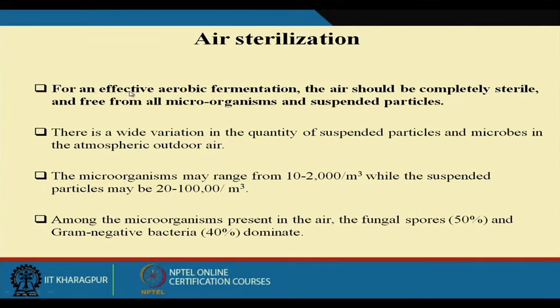Since we are passing air more and more, there is a possibility of contamination in the fermentation process. So the question comes, how will we sterilize the air? For an effective aerobic fermentation process, the air should be completely sterile and free from all microorganisms and suspended particles. There is a wide variation in the quantity of suspended particles and microbes in atmospheric outdoor air.